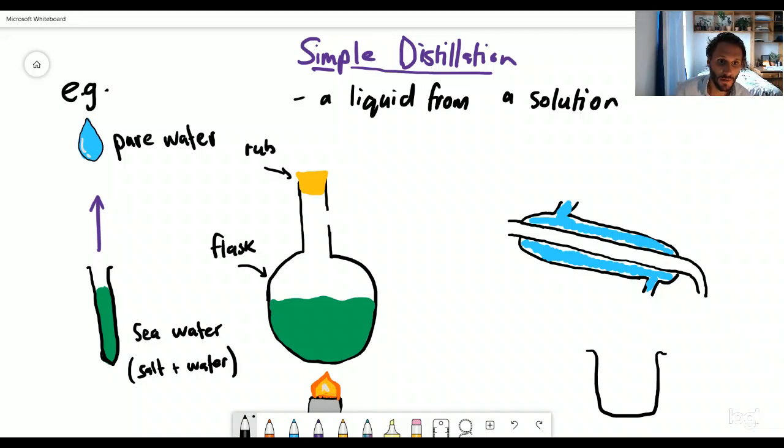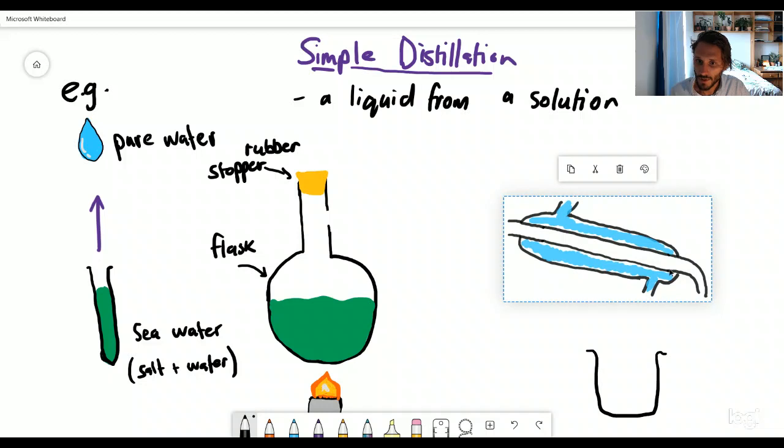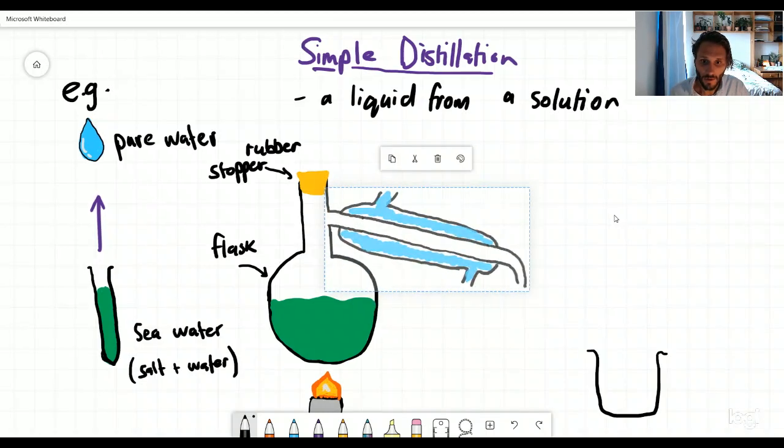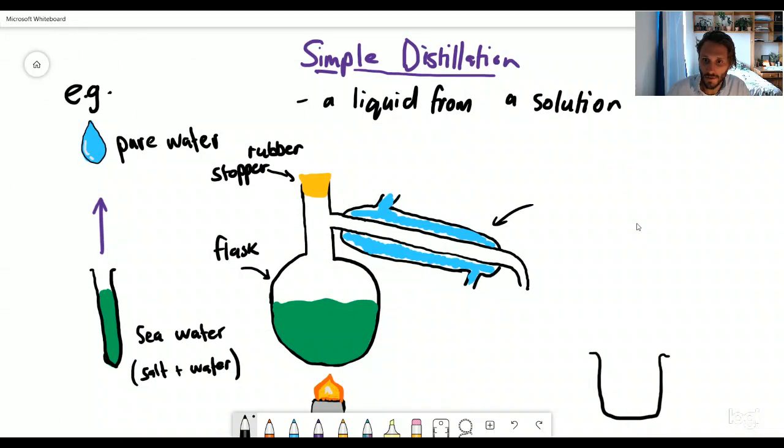You've got a rubber stopper over here that is going to seal everything inside the flask. And then we have this little thing over here, which I'm going to attach to my flask like that. And this device over here is called a condenser and it does exactly that. It's going to condense a gas into a liquid. And basically the condenser has two parts. It's got this pipe that's running down the middle and it's got this outside device called a water jacket.